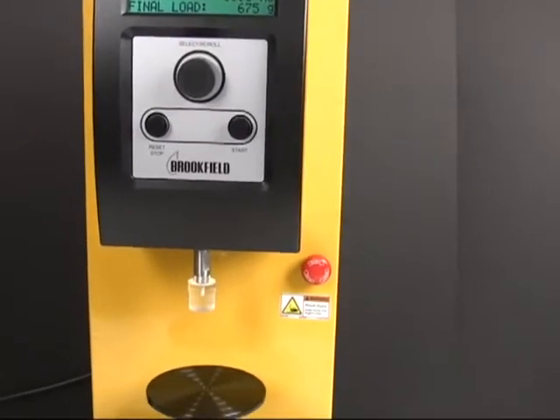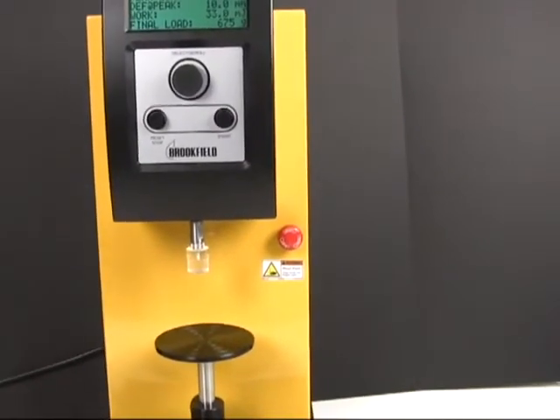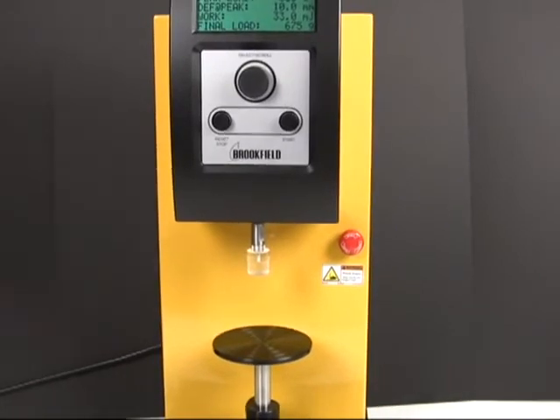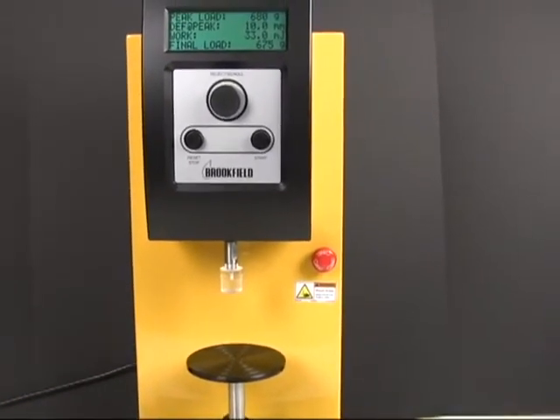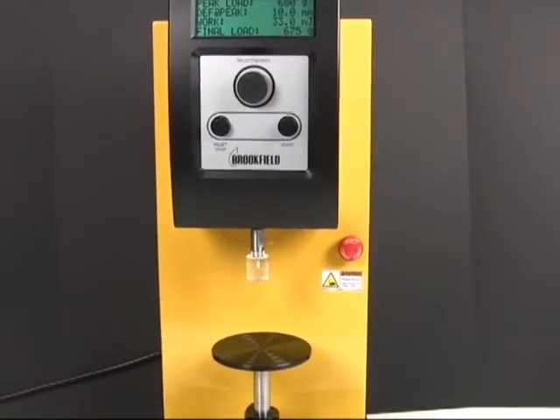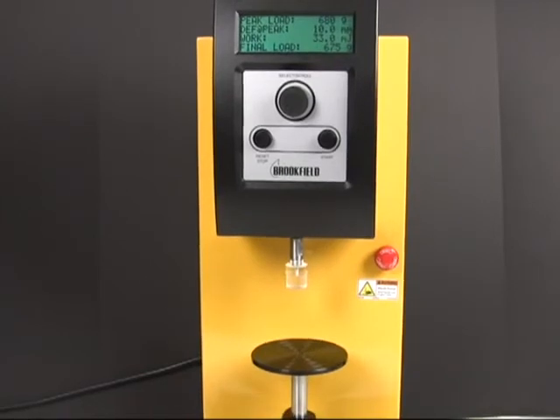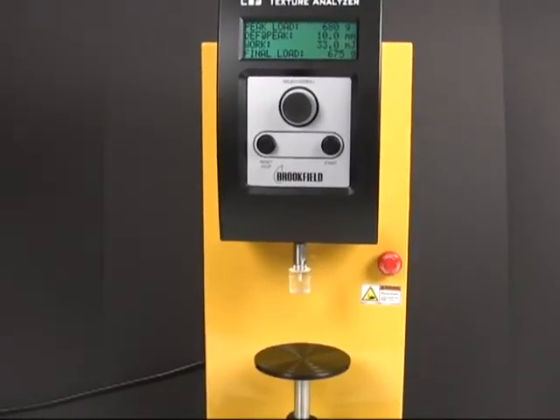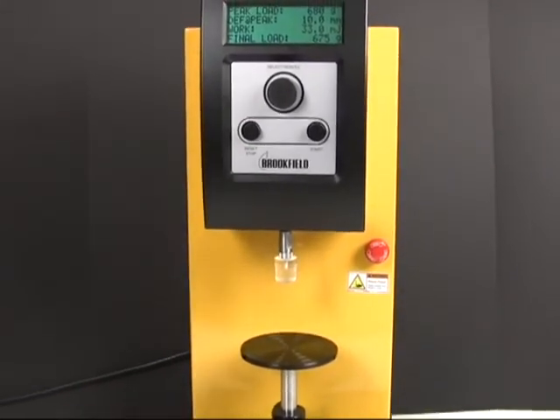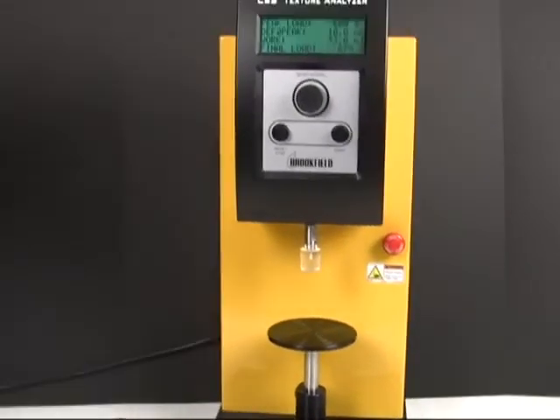In summary, the Brookfield CD3 is a pretty low-end texture analyzer. You can't store positions, which is a huge issue for testing gels and anything in a container. You can't maintain a target force, which makes it pretty much useless for adhesives and medical adhesives. The small travel range of 4 inches, and the distance between the probe and back wall being 3 inches, really limits the type and size of objects you can test. Not being able to change the load cell limits your flexibility. If you buy the instrument to test one thing, you better hope anything else you want to test fits within the same range of calibration and weights.